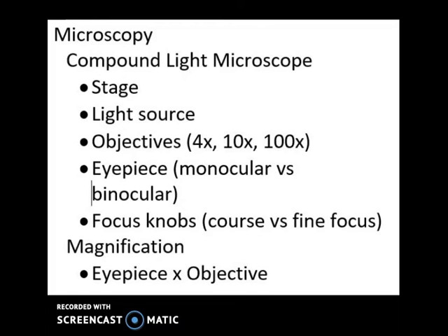Okay, so I'm going to start off with the first portion of the lab, which is your introduction to microscopes. I'm sure most of you have used a microscope, but we do have to do that annoying little go over to make sure everybody knows how to care for them.